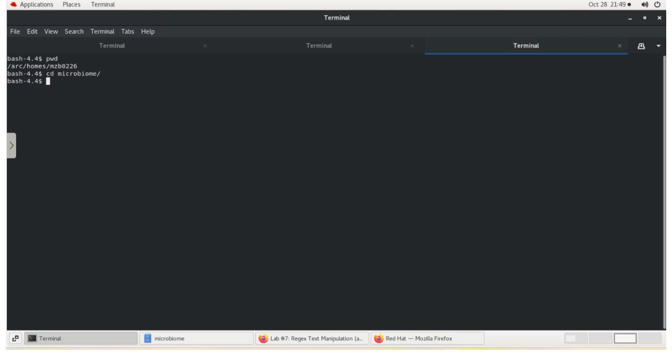I don't know why it's not showing me, but I have done it just a few minutes earlier. So secure copy, then you would need to write your supercomputer account, user 1 22, then you would put a colon, then your path. If you put a period after it, that means you're commanding it to copy that in this directory. So if you run it, it's just gonna copy the file in this directory.